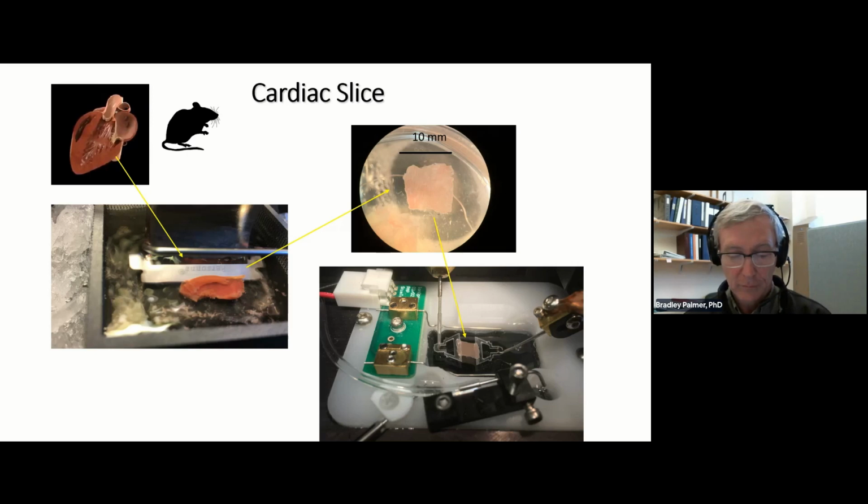The question is, when you work with cardiac muscle, are you concerned about monitoring diastolic sarcomere length? Yes or no?